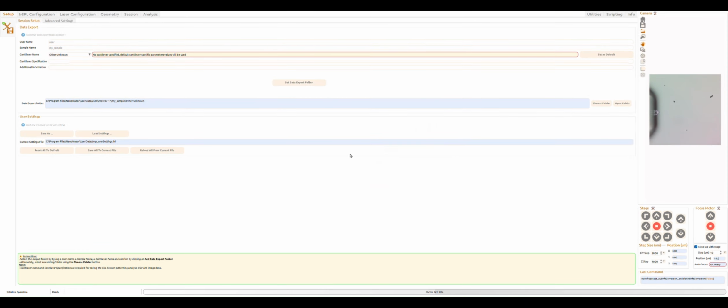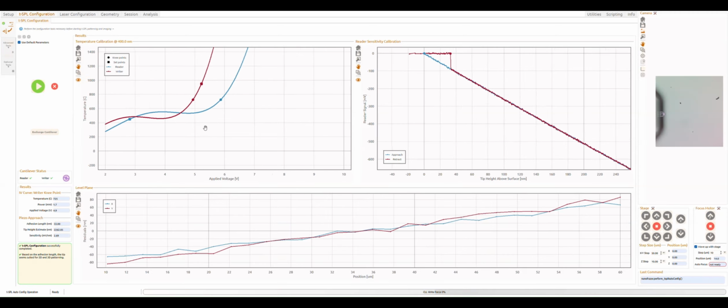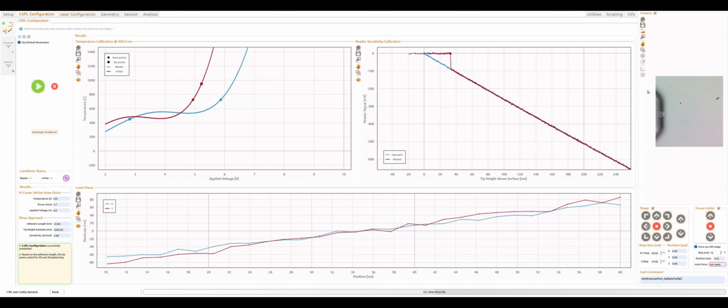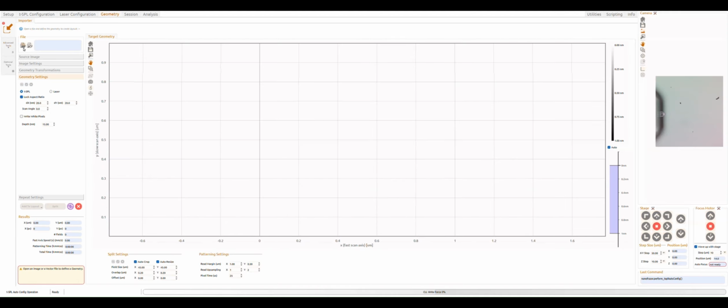So we see now our NanoFrazor software simulator, which is started finally with the camera here. We can also run a fake t-SPL configuration, which will gather some fake IV curve and an approach and sample level plane data. Of course, these are just fake data because we are not using any tool. We can do the same with the laser. We can also check the optional laser tools, laser efficiency calibrator, and so on. And also import a geometry. And we can also see together that we can simulate a pattern.